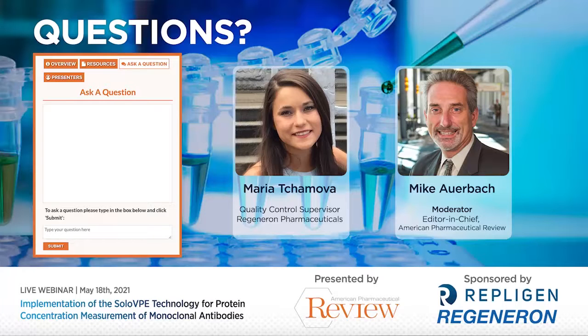Thanks, Maria. Okay, looking at our next question, have you encountered any product that has varied extinction coefficients at different concentrations due to increased intermolecular interactions, especially at a high concentration? If so, how did you address this issue to establish a valid extinction coefficient suitable for the intended concentration range? That is a very interesting question. We have not encountered anything like this with our current products.